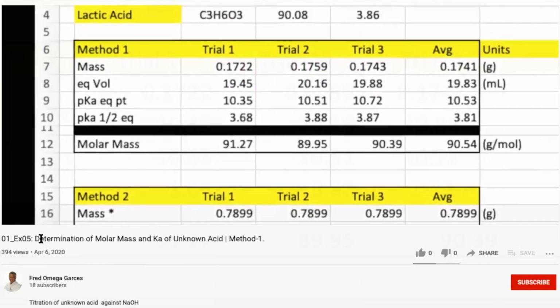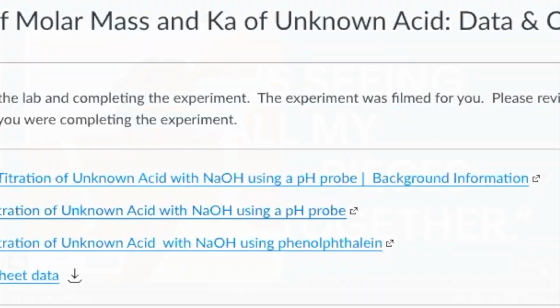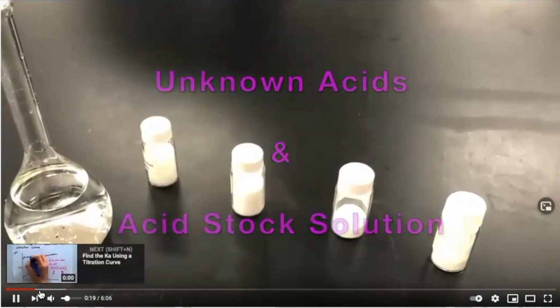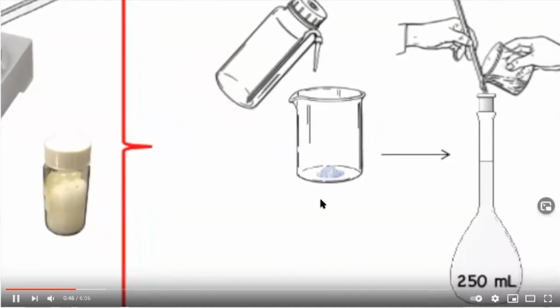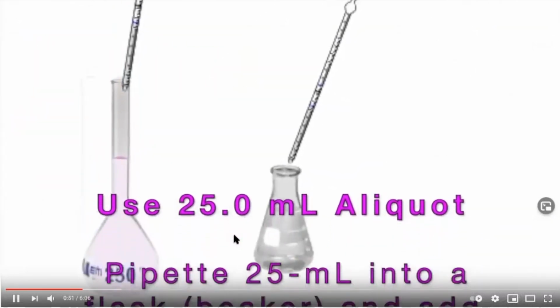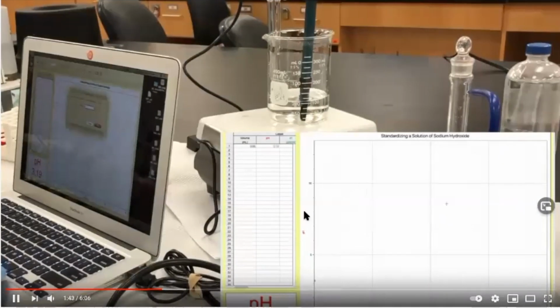That's just the data. So let me go ahead and end that. Okay, here it is. So see how I have these acids again, and I'm putting it in a 250 mL volumetric flask. And here again is the procedure. Weigh it out, put everything in, and then take a 25 mL aliquot. So you're only taking 1/10 of that original solution.